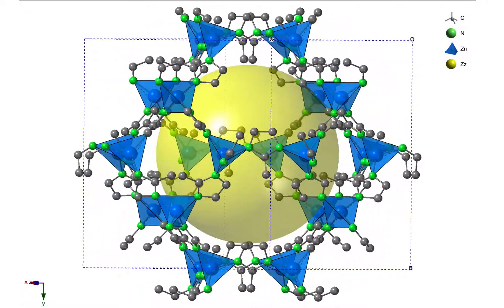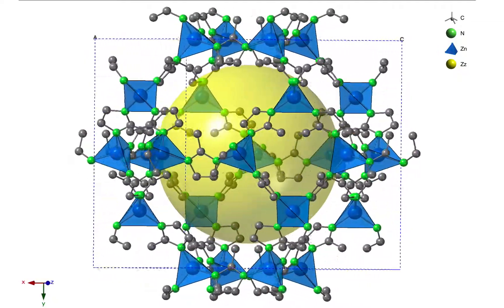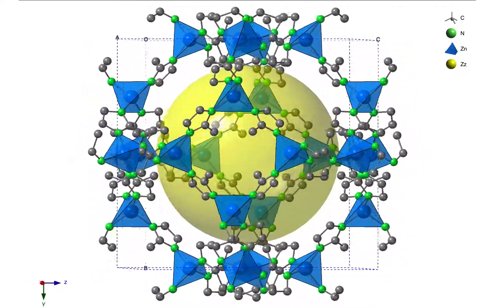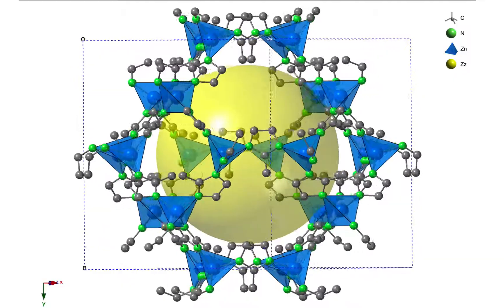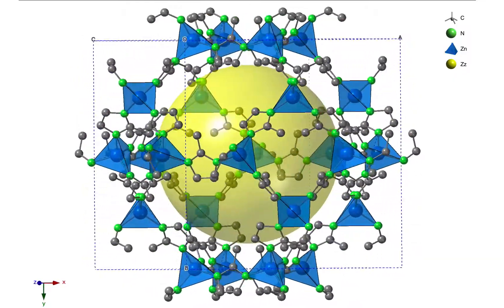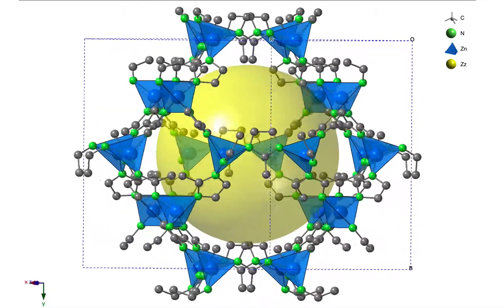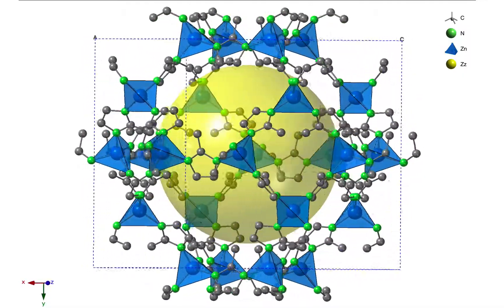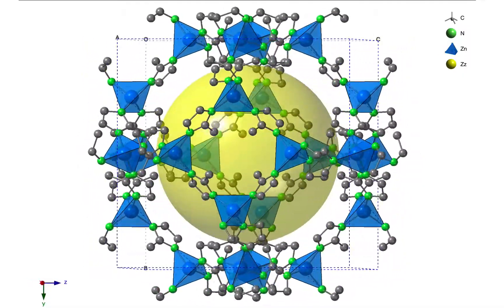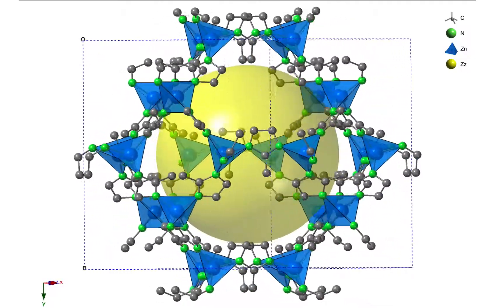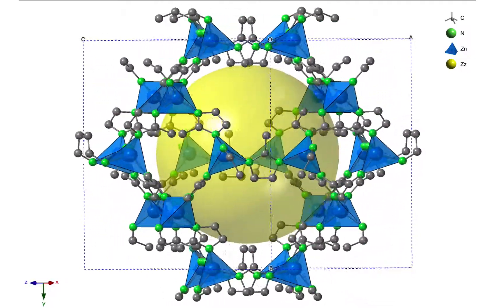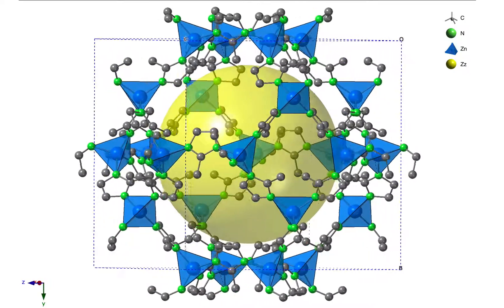Welcome to CrystalMaker 10. In this tutorial we're going to use CrystalMaker's new cavity finder to locate large cavities in a porous structure, and we'll use that command to add dummy atoms at the centers of the cavities sized appropriately to show the effective amount of free space inside the cavity.